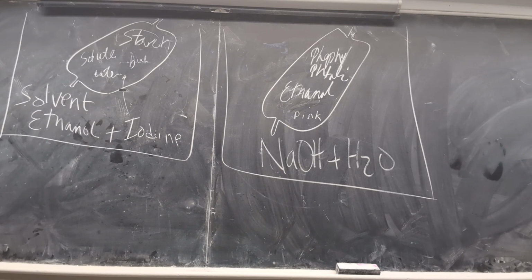We're supposed to have many bags, and the more starch we add, let's examine how fast it goes through. Look, Christopher, I just said, should we put more starch?